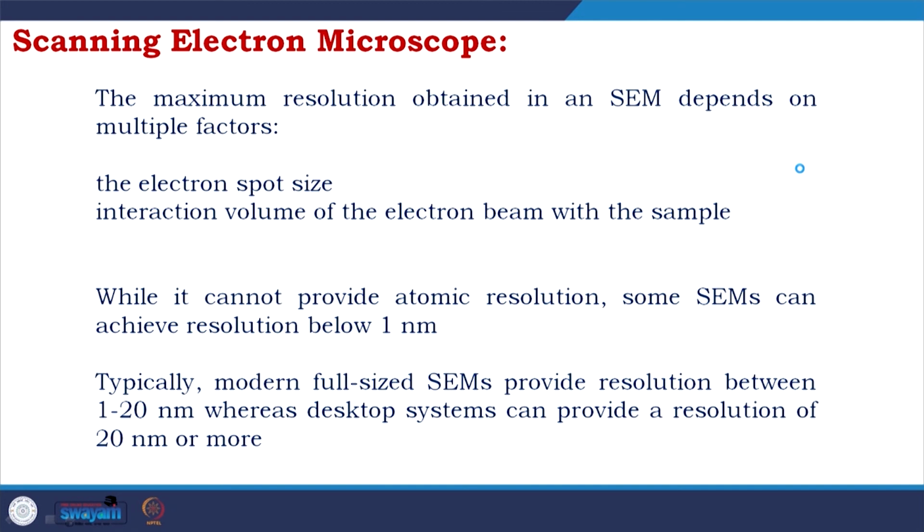20 nanometers or more. So, what we did in this class, we have started our topic of cryo-electron microscopy, and when we start cryo-electron microscopy, this gives us a lot of basic questions. To answer them, we go to the concept of microscope, we know about what is light microscope and how it starts with the concept of observation.